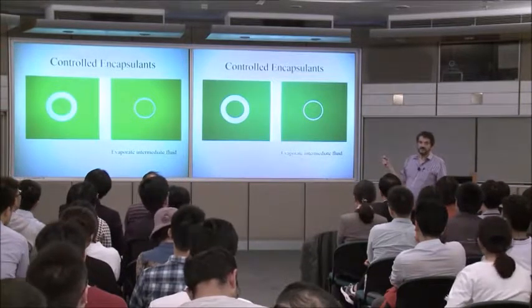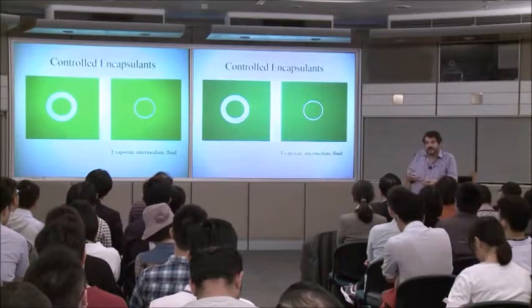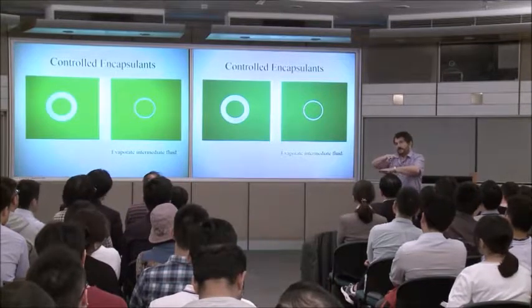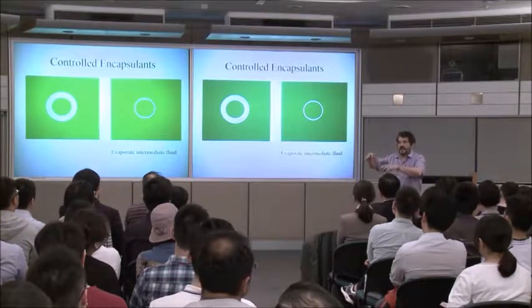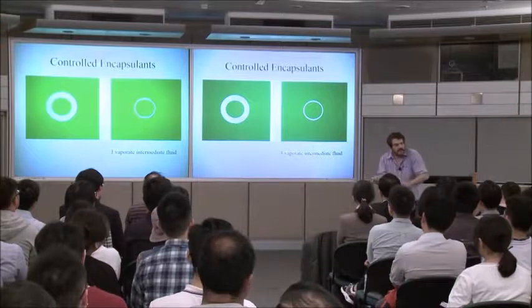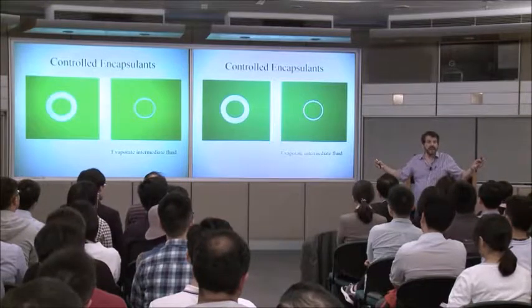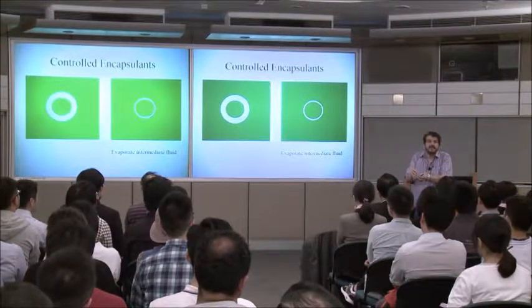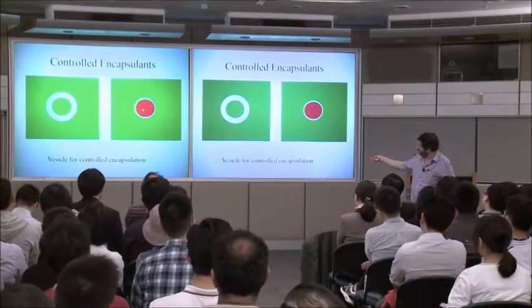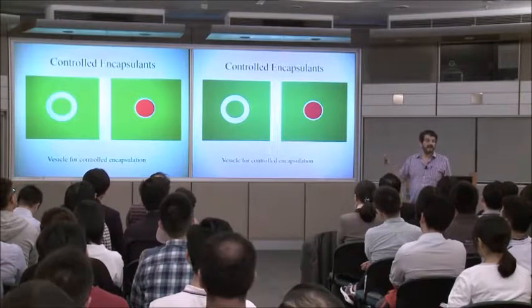Liposomes or vesicles are often used for encapsulation, particularly of drugs, because they look sort of like a cell, so they're nice to encapsulate. But the normal way of doing that is you take these phospholipids, you make a multi-layer structure of these things, you put the drug in water, you bubble nitrogen, and they self-assemble into these bags that contain everything. That's good. That encapsulates things very well, but this very valuable drug that you're trying to encapsulate is everywhere. So you've just encapsulated a small fraction of it. Here, the drug can be here, and this fluid and this fluid are completely different streams. So now you can make really nice encapsulation structures very, very simply.